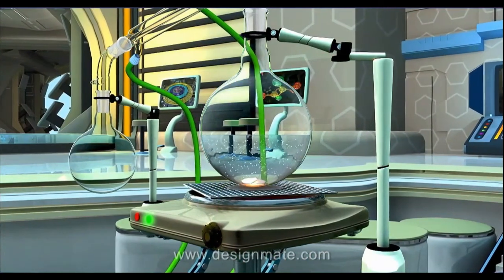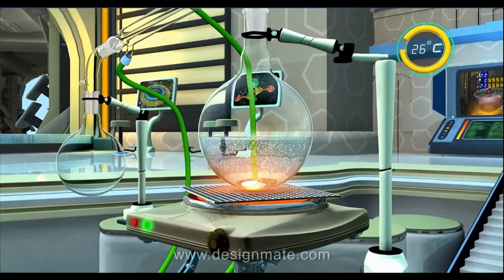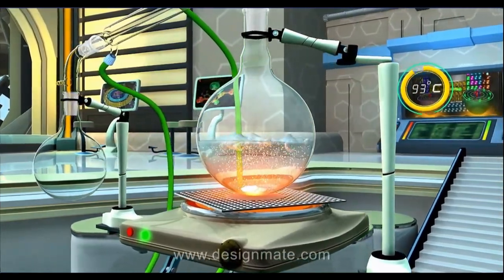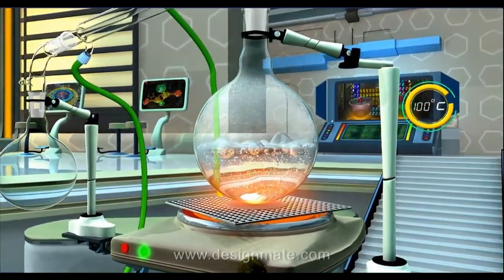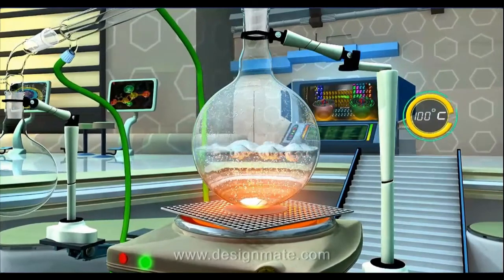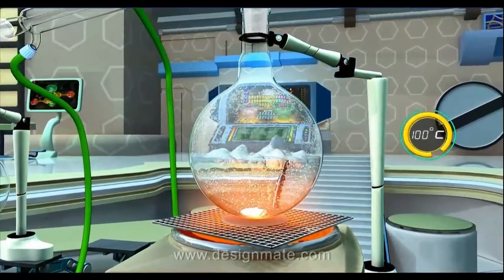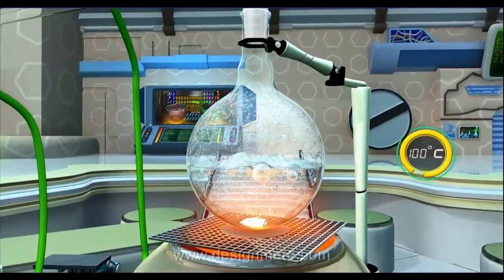Turn on the hot plate. The water gets heated and the thermometer records a rise in temperature. After some time, this water begins to boil and changes into steam, while the dissolved salts present in the seawater remain unaffected as they have higher boiling points. Till all the water vaporizes, the temperature remains constant at 100 degrees.